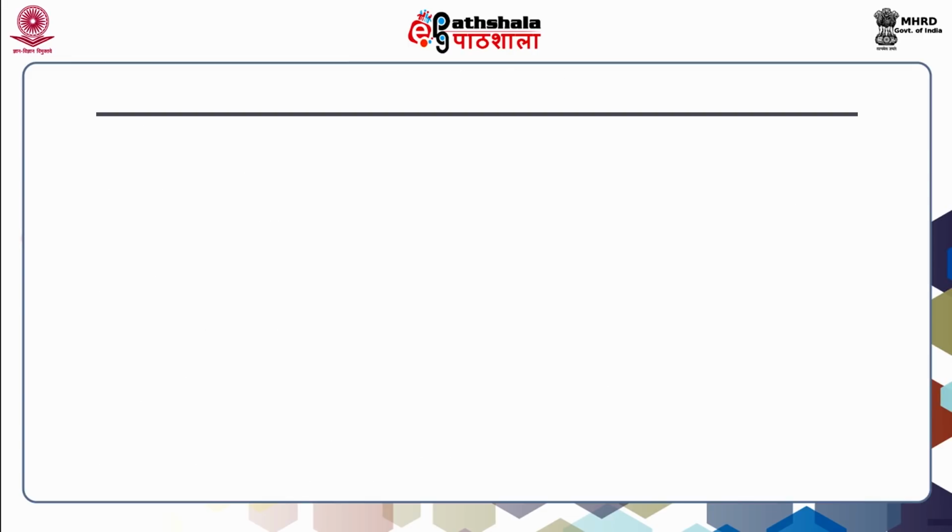So far we have discussed different stationary phases, the different stationary phase column formats, and also the mobile phases and the different techniques of HPLC based upon the mobile phase and the stationary phase. Let us see how the stationary phase is packed in the columns. We need to fill the column formats with the stationary phase, which we will discuss in this coming slide, that is the stationary phase packing.